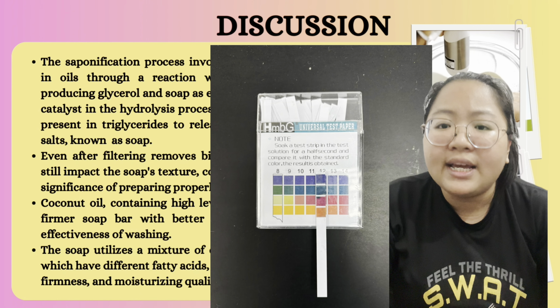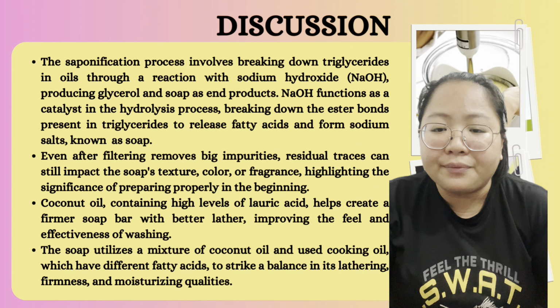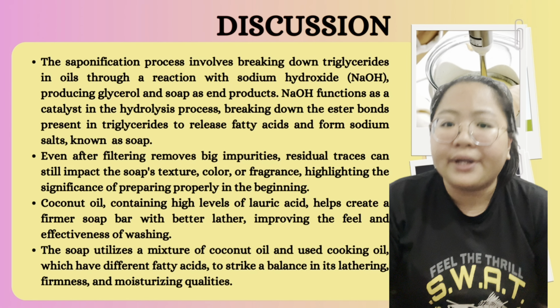During saponification, the lye reacts with the fatty acids in the cooking oil to produce soap and glycerin. The alkaline nature of lye raises the pH of the solution, facilitating the breakdown of fats into soap.